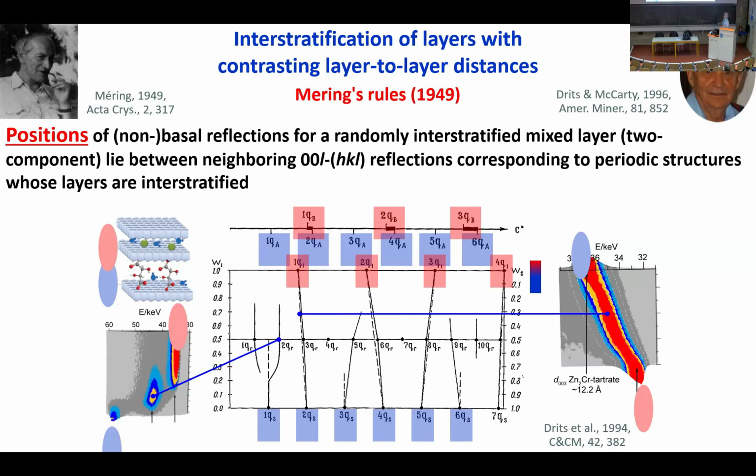And from this identification, I should be able to determine a relative proportion of red and blue layers. No problem. And this has been the basis for a lot of identification methods that were proposed from the late 1970s to early 1990s, essentially.